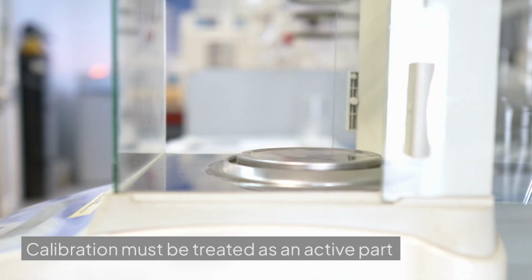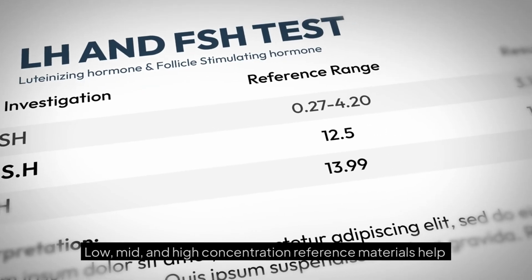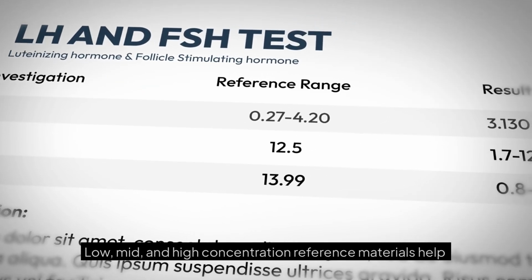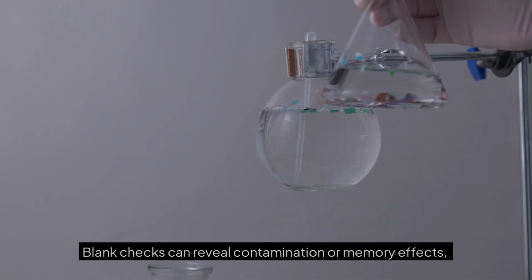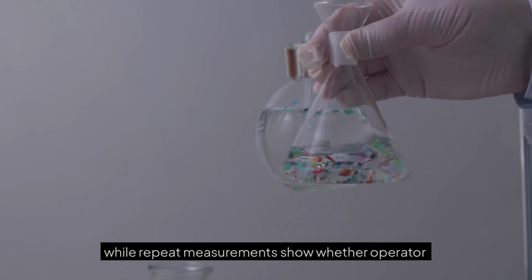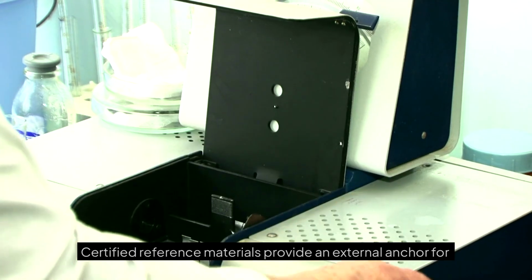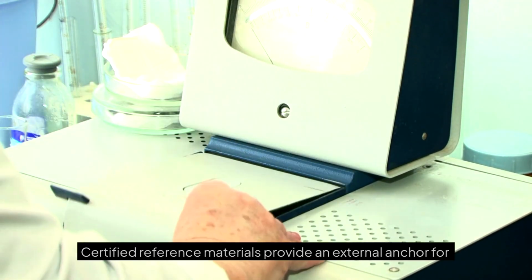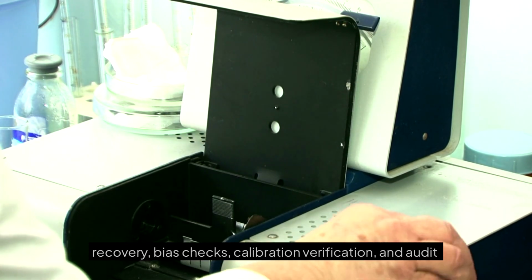Calibration must be treated as an active part of the quality system. Low, mid, and high concentration reference materials help demonstrate response across the working range. Blank checks can reveal contamination or memory effects, while repeat measurements show whether operator technique contributes significant variation. Certified reference materials provide an external anchor for recovery, bias checks, calibration verification, and audit records.